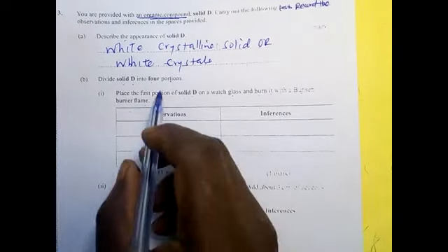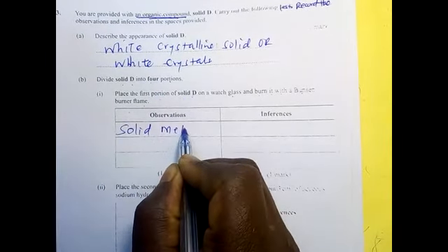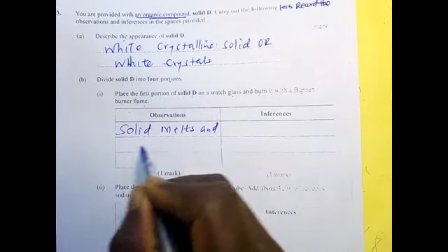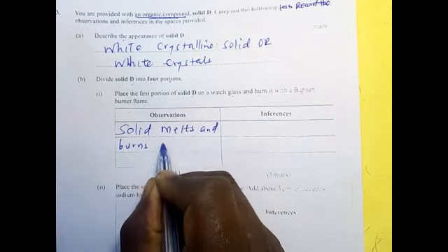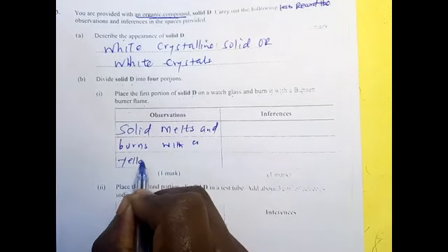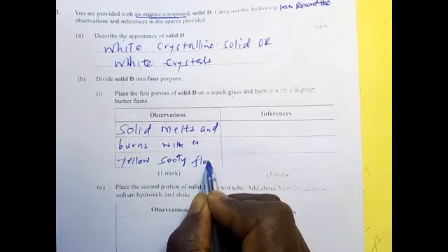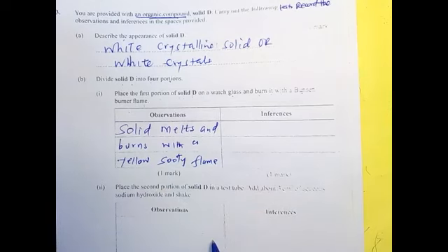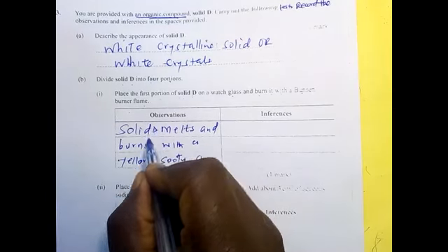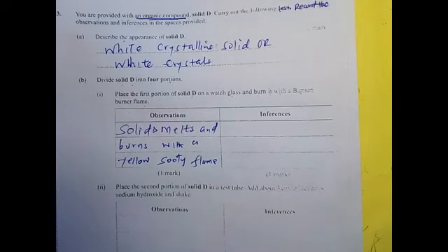Then what happened? Remember, it is a solid, so the solid melts and burns with a yellow sooty flame. The solid D melts and burns with a yellow sooty flame. Now we want to know whether it is a saturated organic compound or unsaturated.